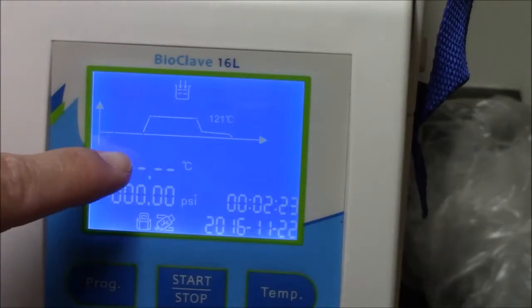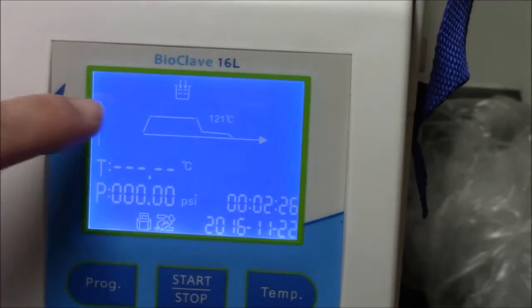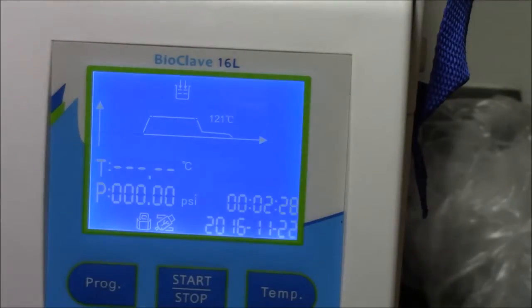This is the program that will run, getting up to 121 degrees Celsius for a certain amount of time, about 30 minutes.